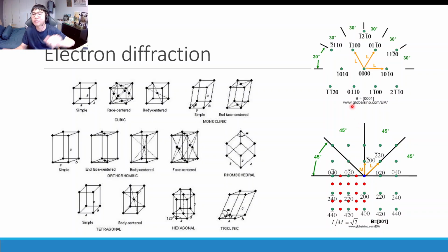So actually, this is a fairly technical topic of discussion. I would not go in depth into it, of course, but basically, if you know your fundamental relationships between your real space and reciprocal space, and you do the resultant mathematical computations, you can deduce both the crystal structure as well as the lattice parameter from the diffraction pattern, as well as, of course, deduce the zone axis of this particular pattern.